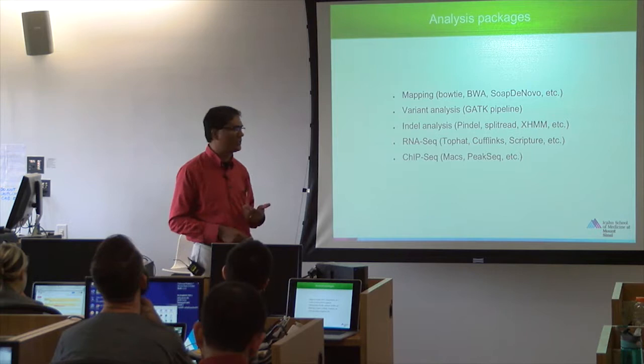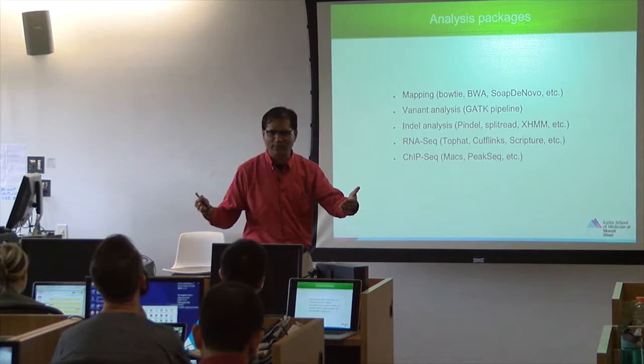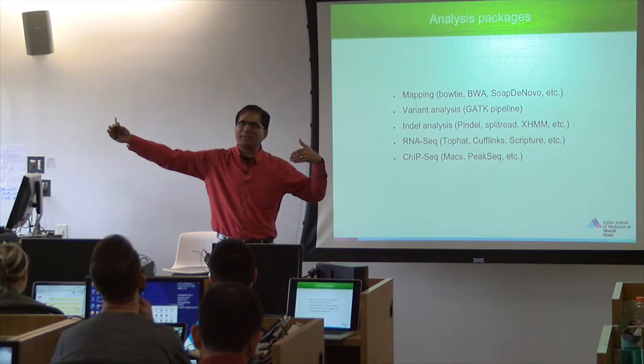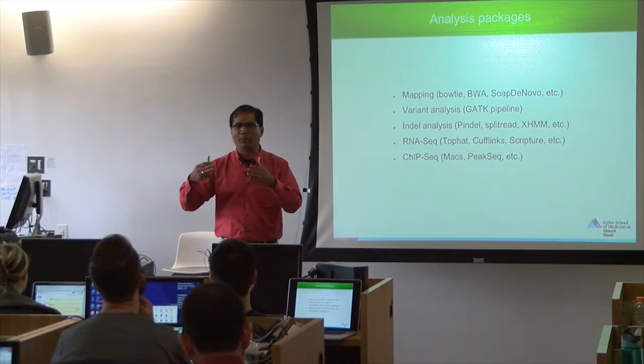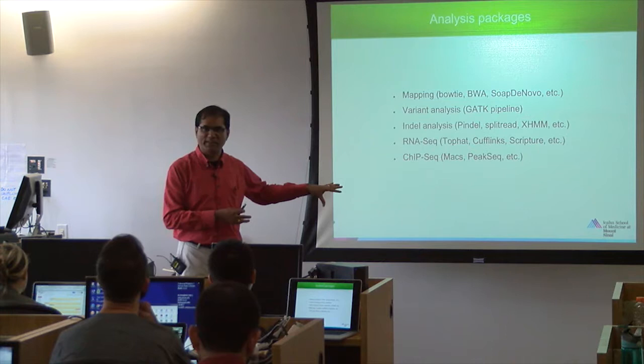And now you develop pipelines, you have Galaxy here. All of them can be put into one web page. You can use all at the same time. You can develop platforms, and then you can also share this information between labs. There are portals to do that, and so on and so forth, right? And you can use your own computer. Now, BaseSpace is there from Illumina. You can have cloud computing to do this on the cloud if you don't have your own supercomputer. So different things are being developed during the analysis of the data, which is being generated by the brilliant work of these molecular biologists. Do you accept?